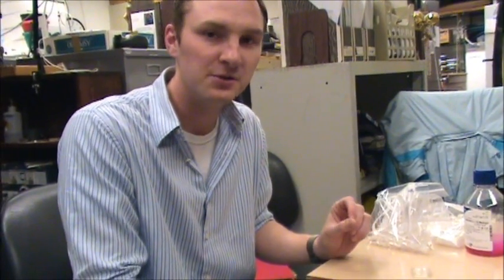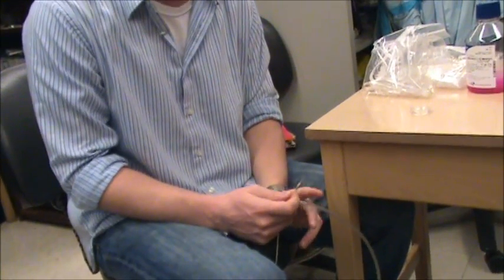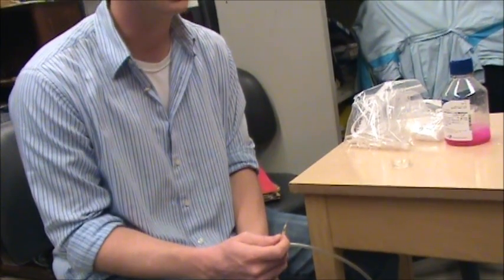Then we desheath the ganglion to take off the connective tissue that's around the ganglion so we can get access to the cell bodies. Then we add 100 microliters of collagenase dispase to the medium, put it on a shaker and let it shake for about 15 minutes. While it's shaking is a good time to prepare electrodes that we'll use to suck out the individual cells.